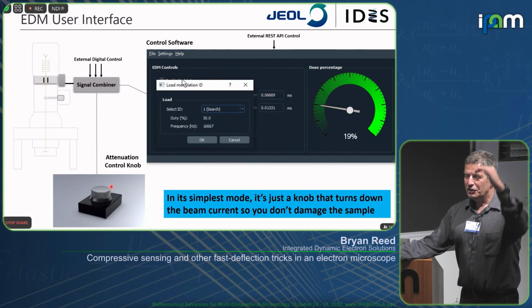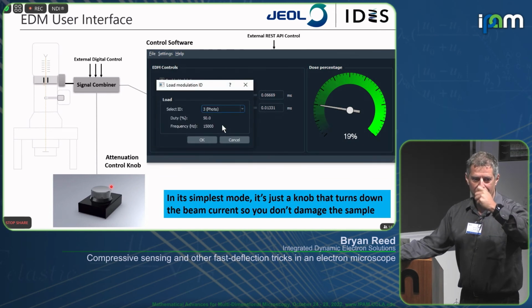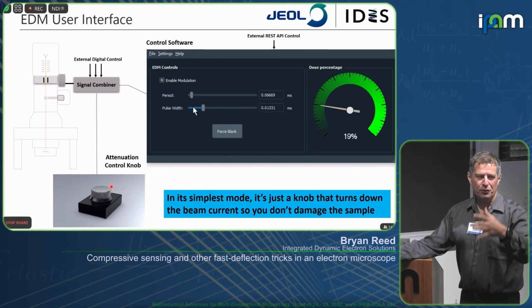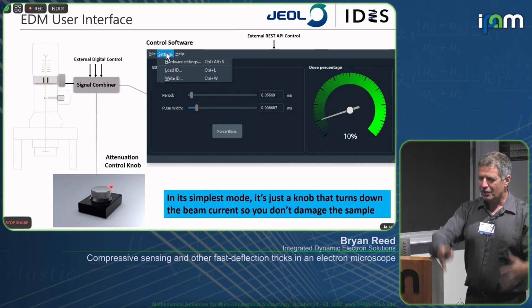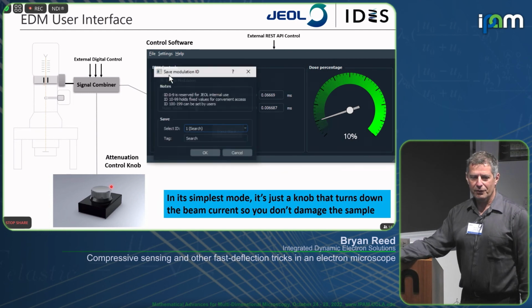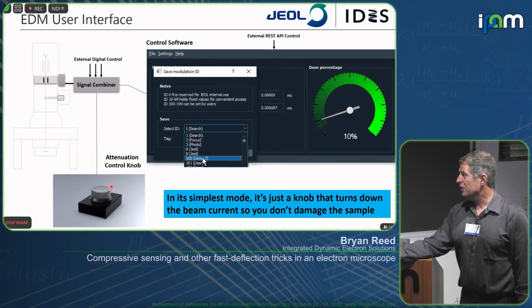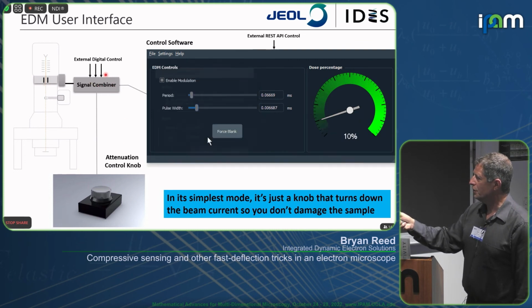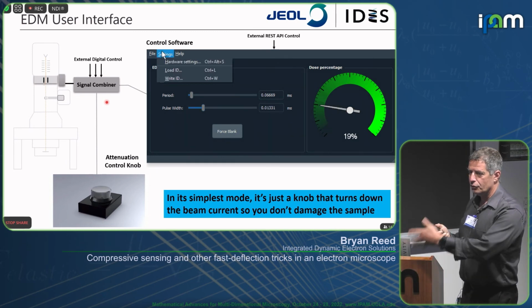Because if you change the beam current in a conventional way, you're refocusing lenses, changing apertures, refocusing something, and oh God, I just spent 10 minutes getting my aberration corrector all set up, and now I need to redo that. And we can also take external input. So if you have any high-speed timing control system, you can control the beam blanker directly.